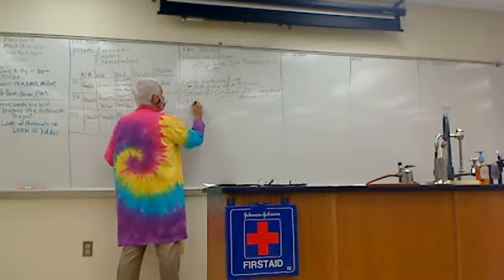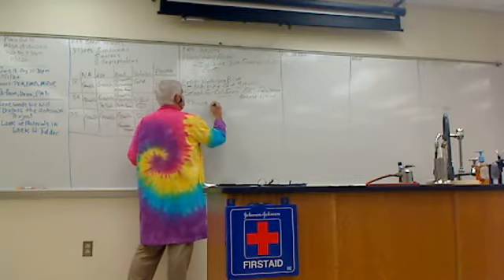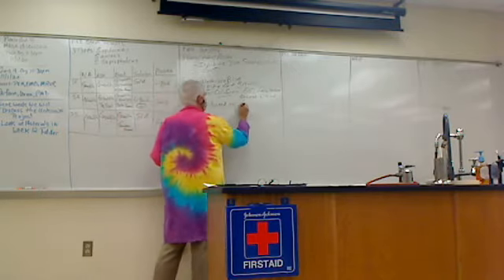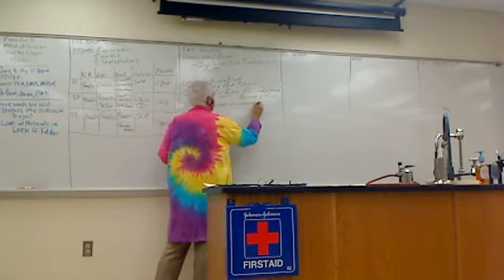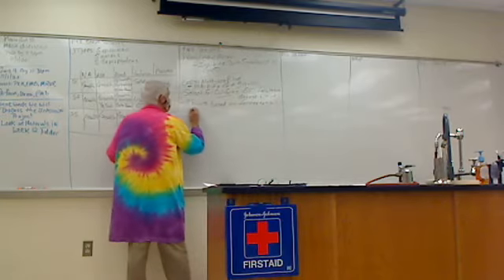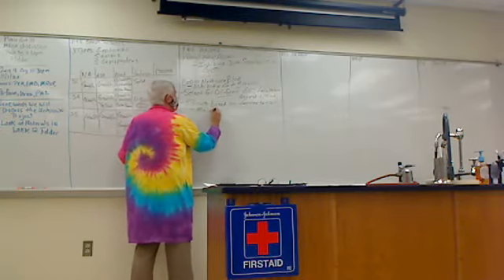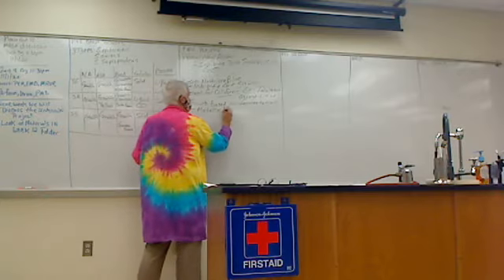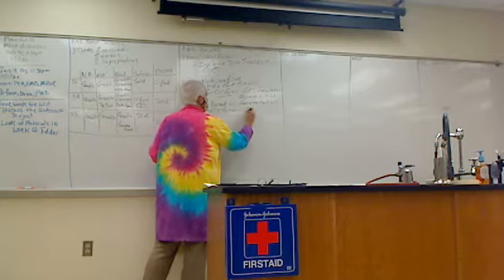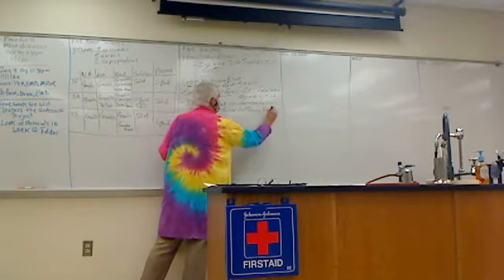And 3 results can occur, guys, based on fermentation. We can have, and this is really cool, guys, the metallic green, if you have a strong fermenter.